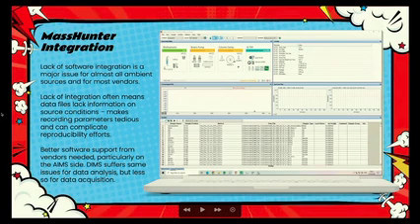So one thing that we're constantly begging for from all vendors is better software support, better integration. Obviously, direct injection doesn't suffer from anything like the same problems on the acquisition side because you're using the same source option and things, but it does suffer from the same data analysis options, which you're going to hear about in just a second.